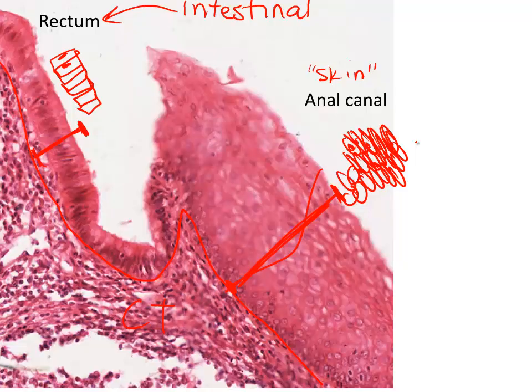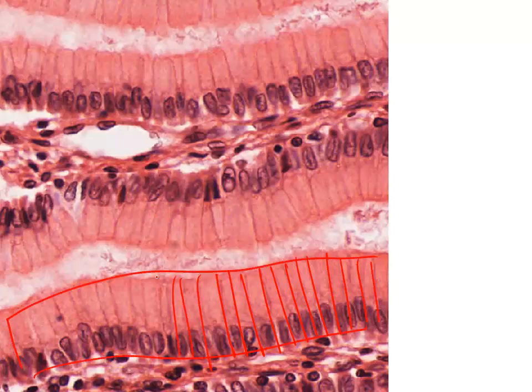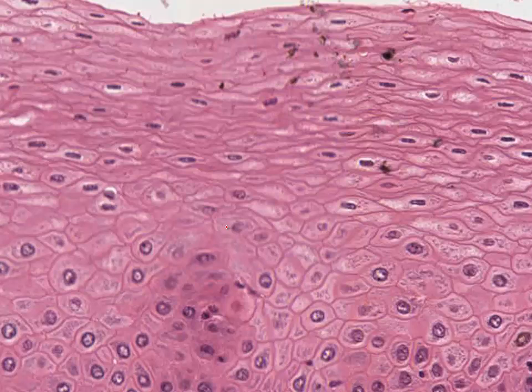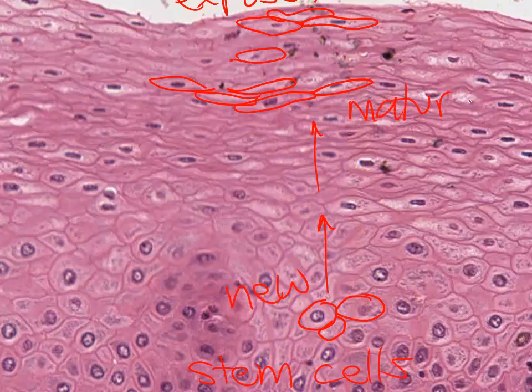All right, this would be a close-up of, say, your stomach or your intestines. Again, the digestive tract giveaway is usually that it's simple columnar. And so again, sometimes in real life it's hard because it looks like simple columnar layers are stacked in there, but that's just the way the cut in the histology image looks. Don't forget, when you see stratified squamous, the mature cells are flat, the cells near the top, but the cells at the bottom where they're being born, the new cells at the basal side and the stem cells, actually look very cuboidal. So sometimes that can confuse students.